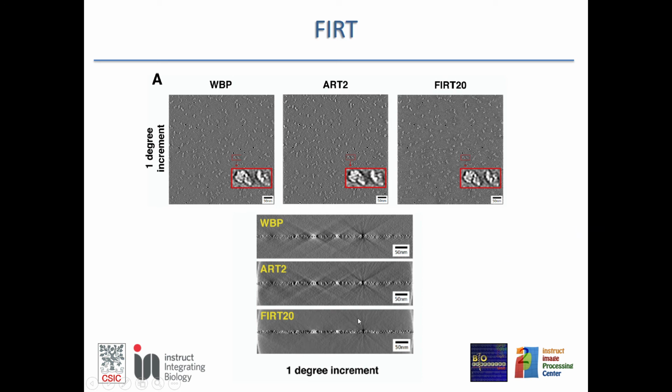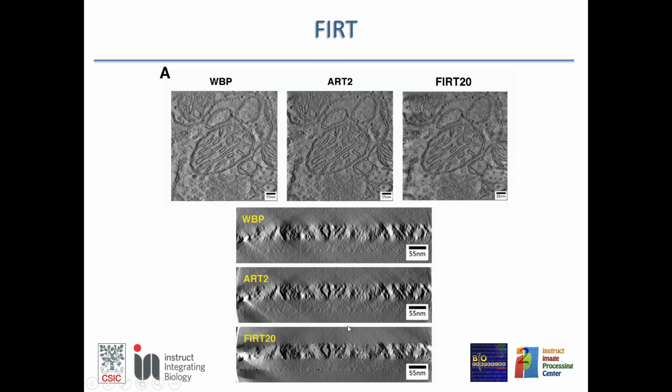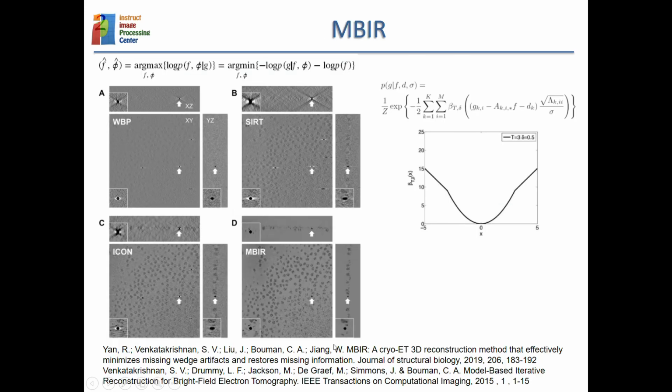It is not that they fully remove the artifacts, but they are much smaller than with weighted back projection alone. And here you have more examples, so weighted back projection and ART and so on. And there has been another suggestion, like from this group, and it is MBIR.